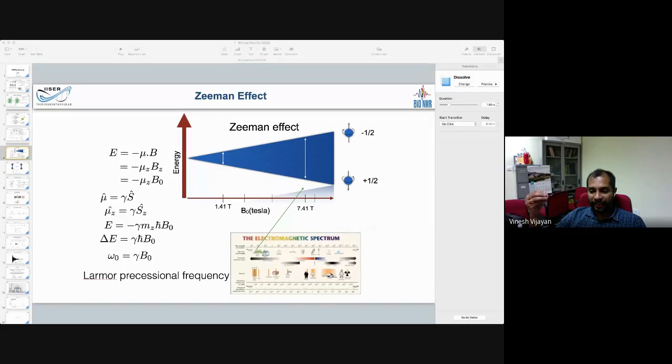The problem with Gaussian or anything is that the chemical shift of a molecule depends also on the temperature. It depends on the solvent that you are using. So there are a lot of parameters, and Gaussian or any software will not be able to represent them fully. Therefore, it is not very accurate to directly compare the measured chemical shift from the experiment with that of a quantum mechanical calculation like Gaussian.